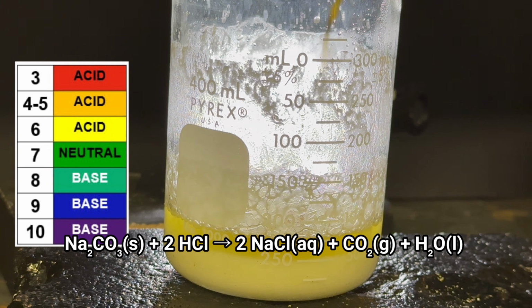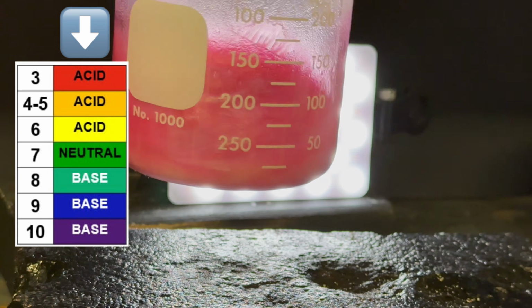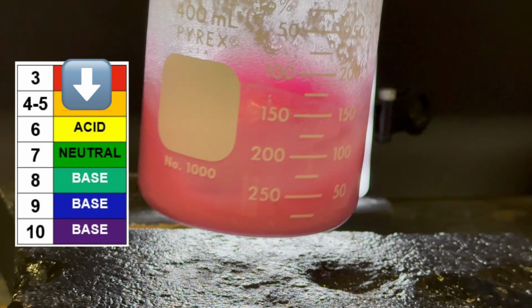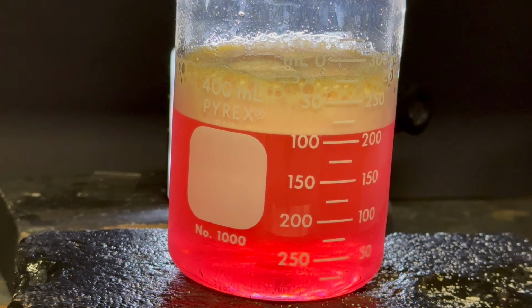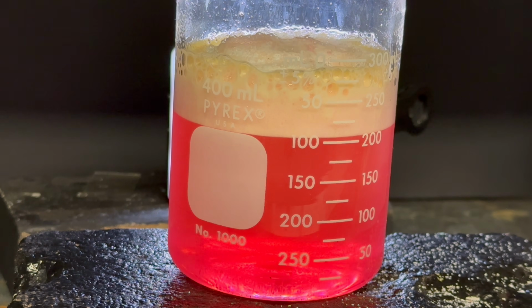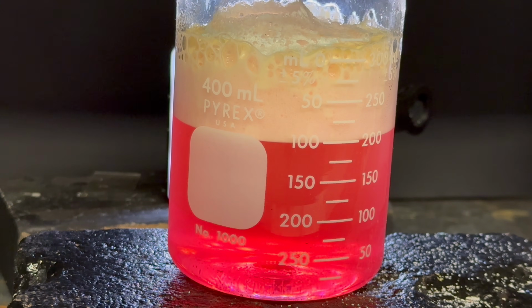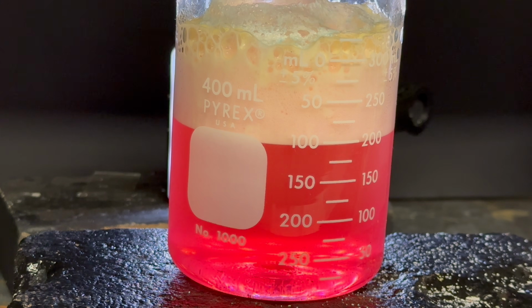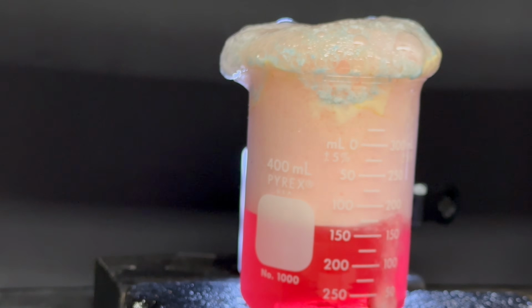I decided to add some universal indicator to help me visualize when the acid was neutralized. You see that red color? Yeah, that tells us we got a long way to go. I added a little water to get everything more dissolved, and then continued to add sodium carbonate. And here's when I noticed that the carbon dioxide wasn't just causing bubbling, it was causing frothing. And that frothing tells us there's protein present in the mixture. The frothing caused a lot of problems.